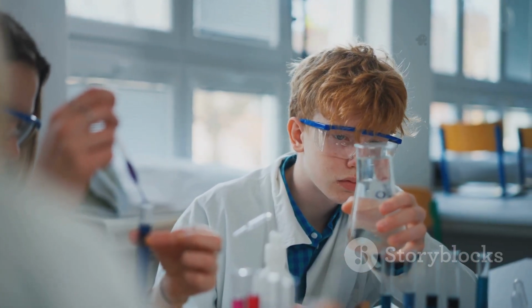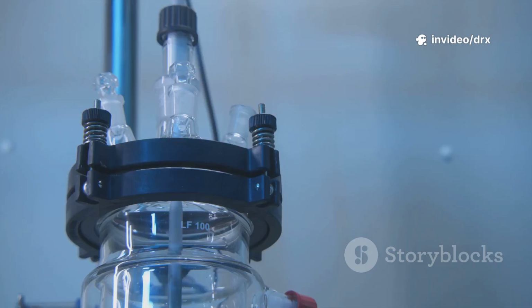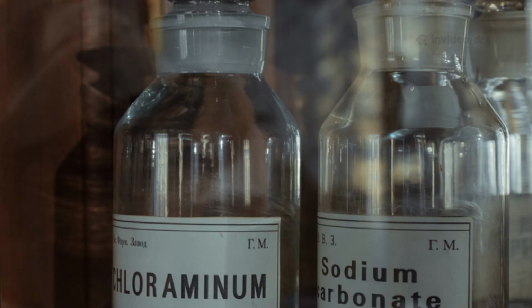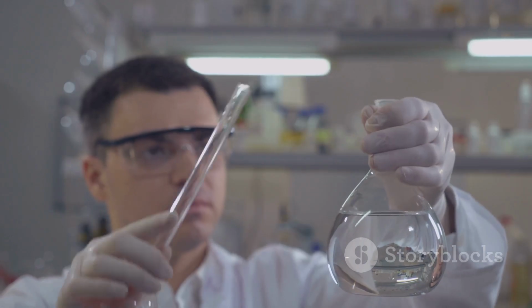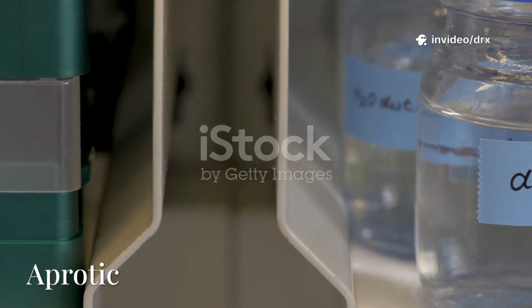Moving on, the next type is protogenic solvents, which are basically acidic solvents. These are the ones that donate protons, or H+ ions. Examples here would be formic acid and sulfuric acid. And, just to mention, these solvents are commonly used to titrate weak bases.